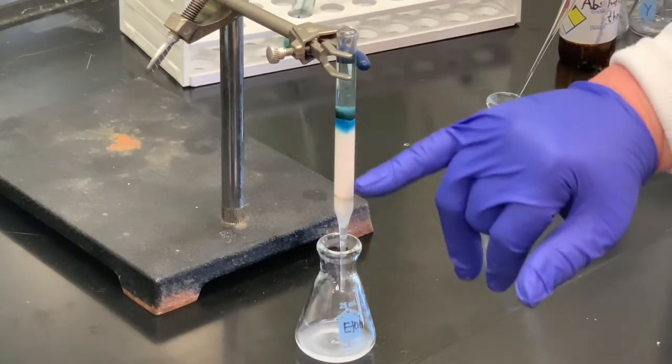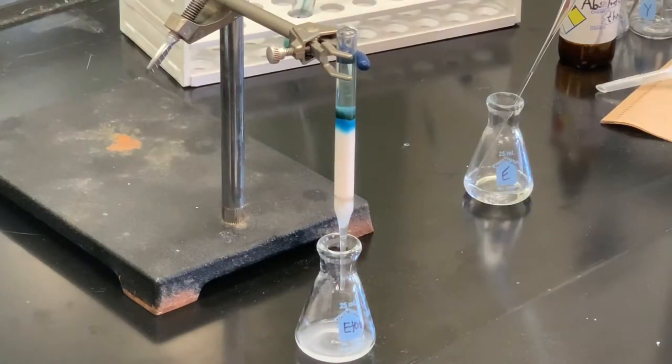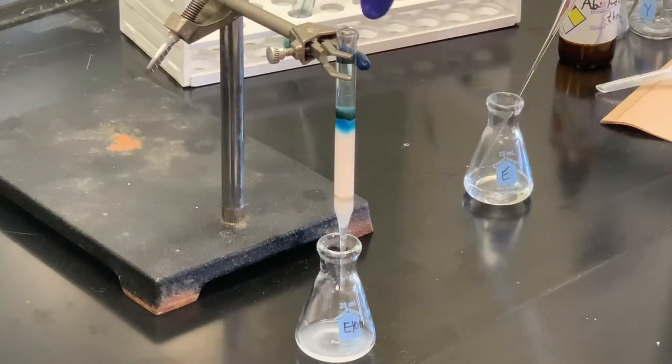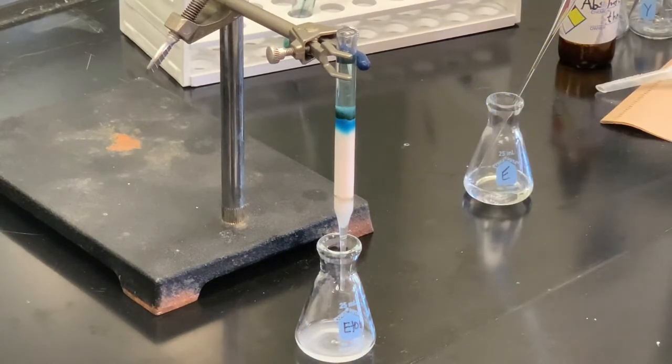This is a very small apparatus, and notice it's taking a tremendous amount of time for it to move. There are other types of column chromatography, one called flash column chromatography. The nice thing about flash column chromatography is there is a reservoir for your solvent, and off the reservoir there is a tube you can connect to a nitrogen container. You can flow nitrogen gas in, and that pressure will cause it to move at a much faster pace — getting something done in a third of the time or less.